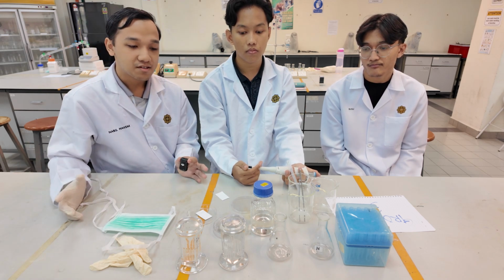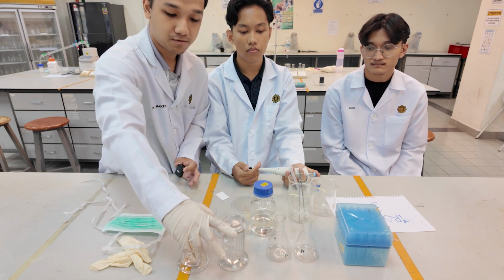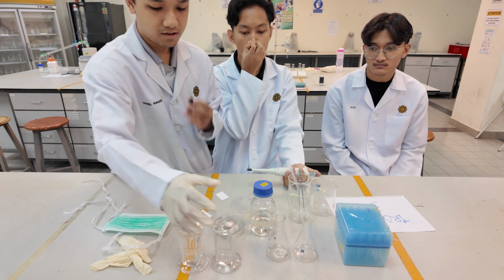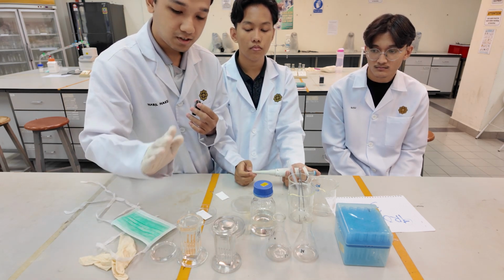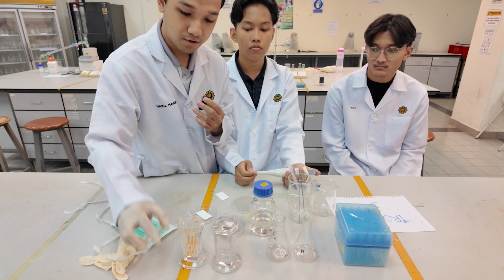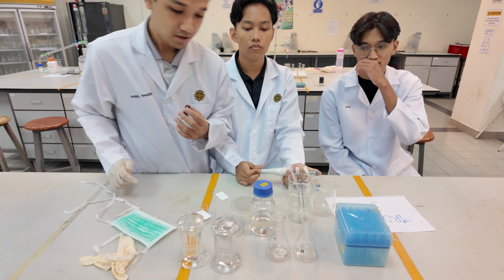When we are preparing the solvent, the sample solvent and the developing chamber solvent, especially for this TLC developing chamber, after we put the developing solvent in this chamber, we must close the lid to prevent the evaporation.